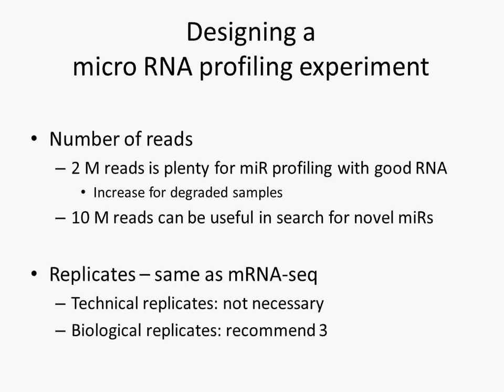microRNAs. In replication, the RNA profile and microRNA profiles are fairly similar in terms of their distribution of low levels and high levels. So we recommend the same replication as for mRNA-seq. It is not necessary to do technical replicates, but we recommend up to 3 biological replicates, so you can use a t-test for your estimation of expression levels at the statistic comparison later on.